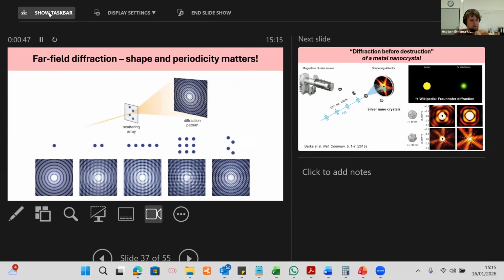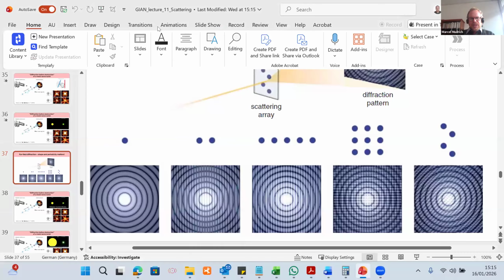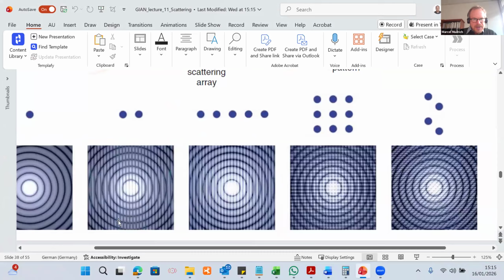Anyway, I think just from Wilmot's book, it shows these patterns for two circular apertures. That's, I think, exactly what we see in your distribution, right?